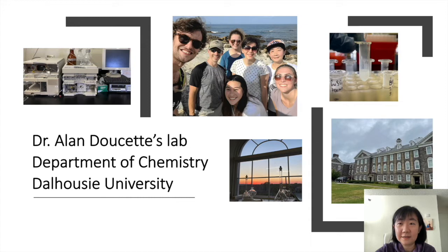For this class, I was willing to present something different from my projects, and although I'm not doing top-down proteomics now, I'm interested in it, especially the new technologies related to it. That's why I chose UVPD as my topic, because it is a relatively new technology for proteomics. It is developing and seemingly has broad application prospects.